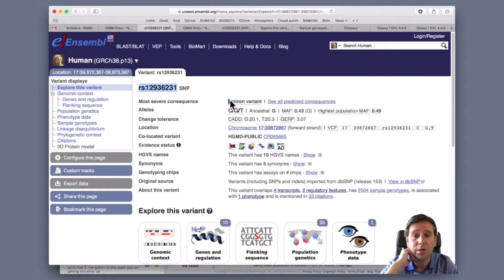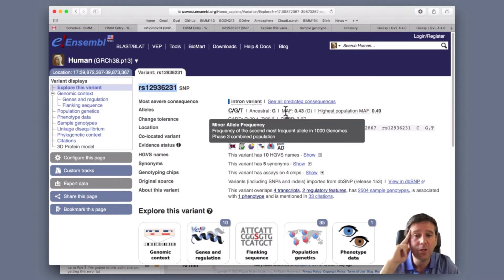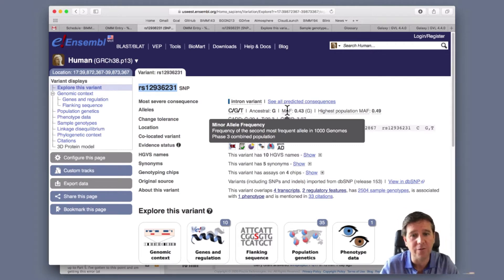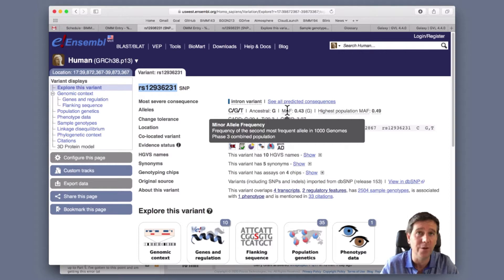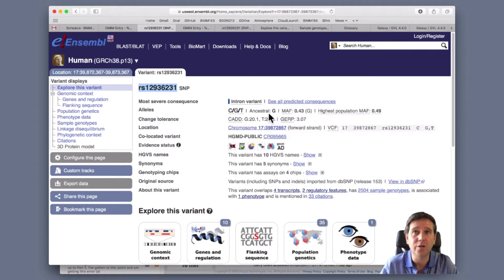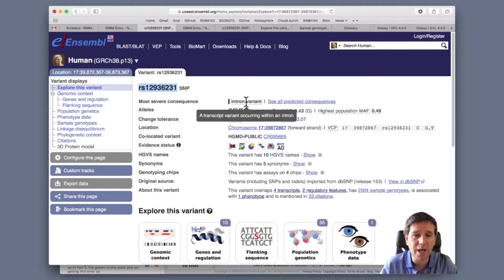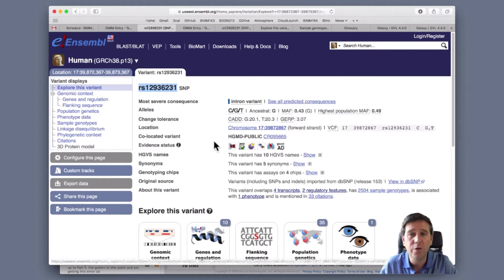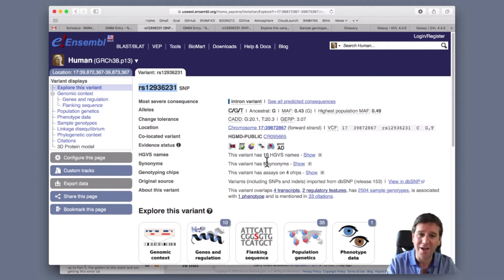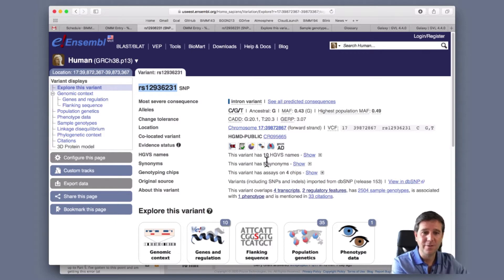It tells us that this is an intron variant - it's in the intronic region, not in an exon of a gene. It tells me the alleles that they've seen are C, G, or T. The minor allele frequency (MAF) is 0.43, and that's a G. The minor allele frequency is the frequency of the second most frequent allele in the 1000 Genomes Project. This is on the forward strand. Now this is an intron, so it lies within a gene but doesn't affect the exon region. The next question in our hands-on session is: what genes do these variants affect?